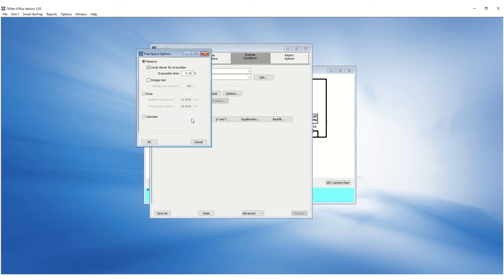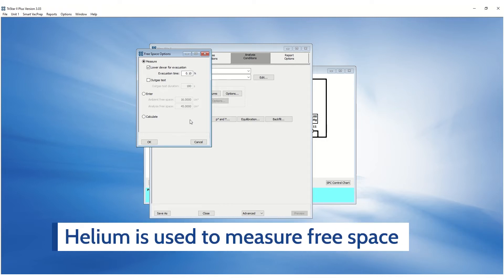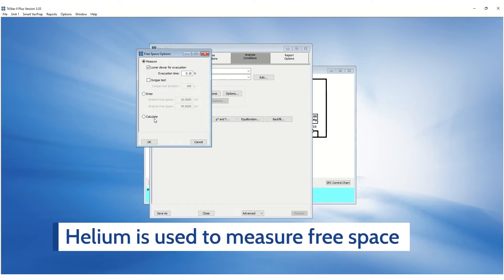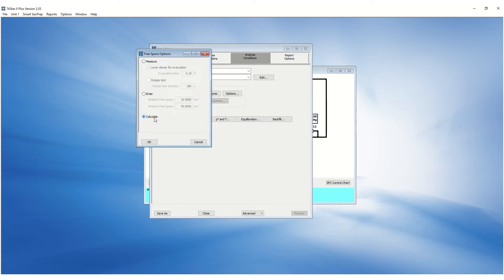Free space can be measured, entered or calculated in the free space options. Helium is used to measure the free space before the adsorptive gas is introduced to the sample. Entered free space and calculated free space are useful when analyzing samples that are known to interact with helium or if you are trying to minimize helium usage. Calculating free space requires blank tube analysis and density of the sample which will be discussed later in this video.